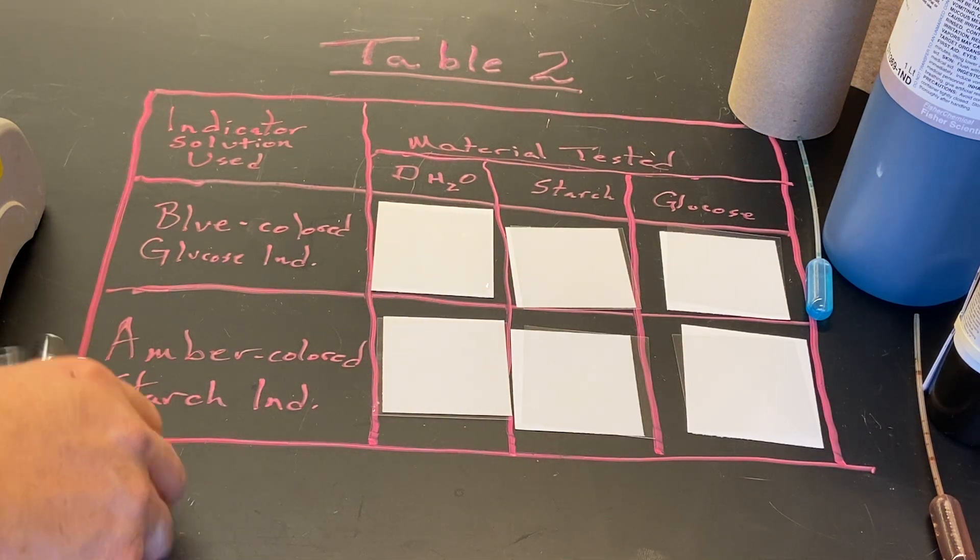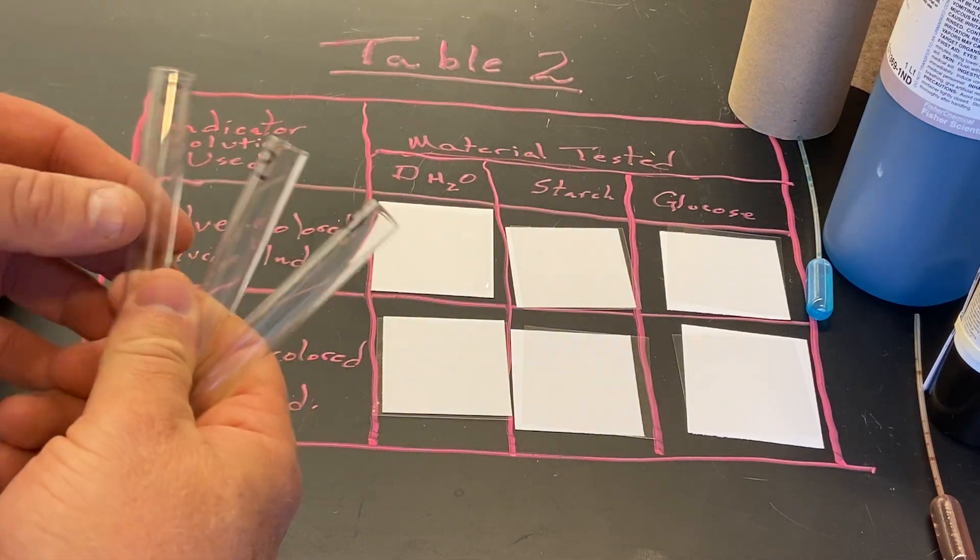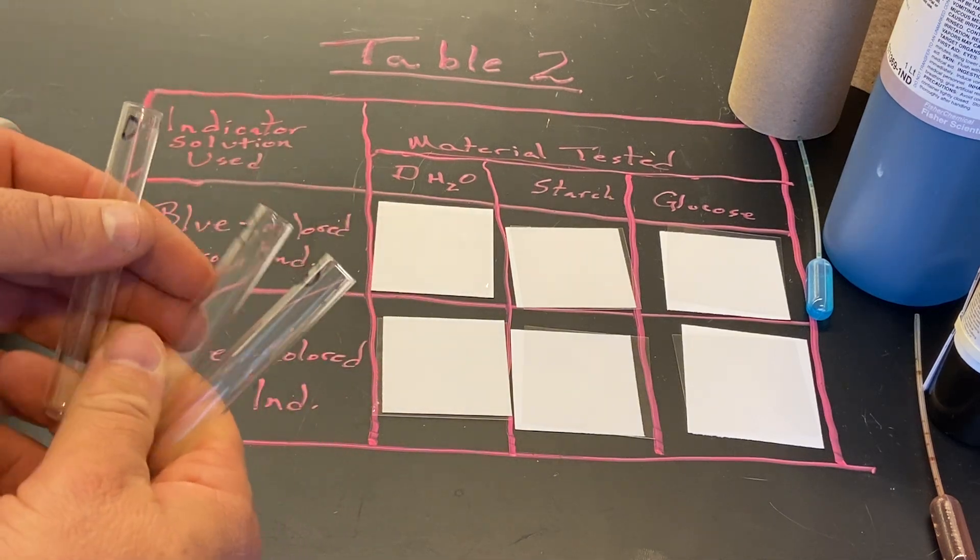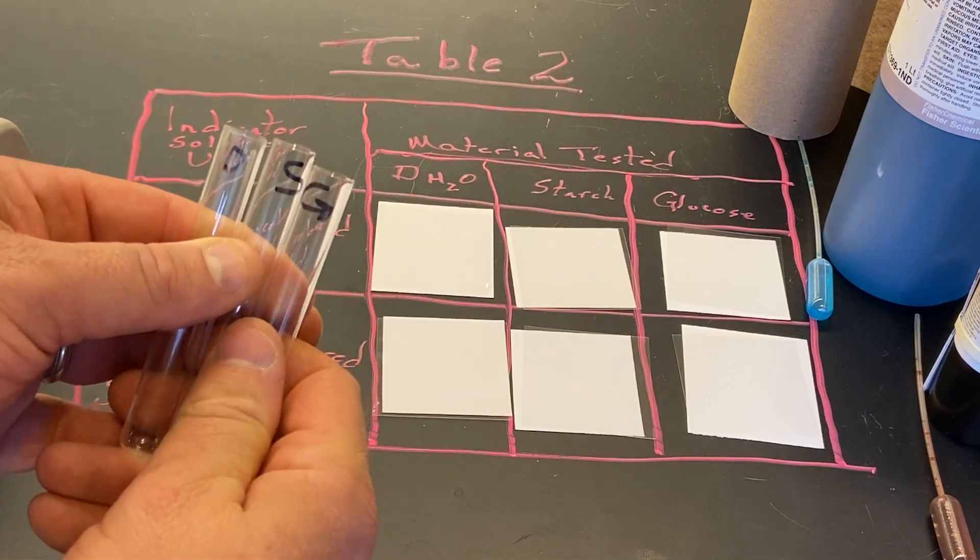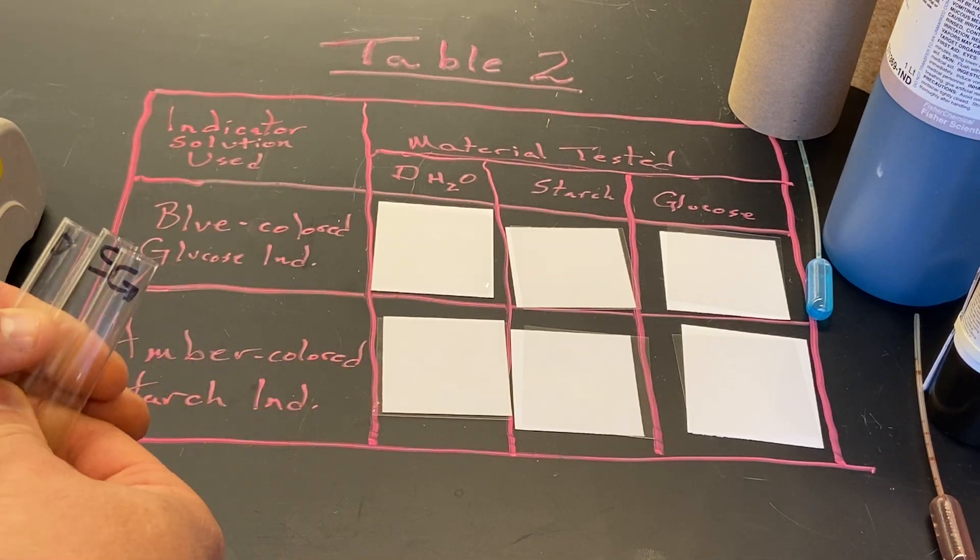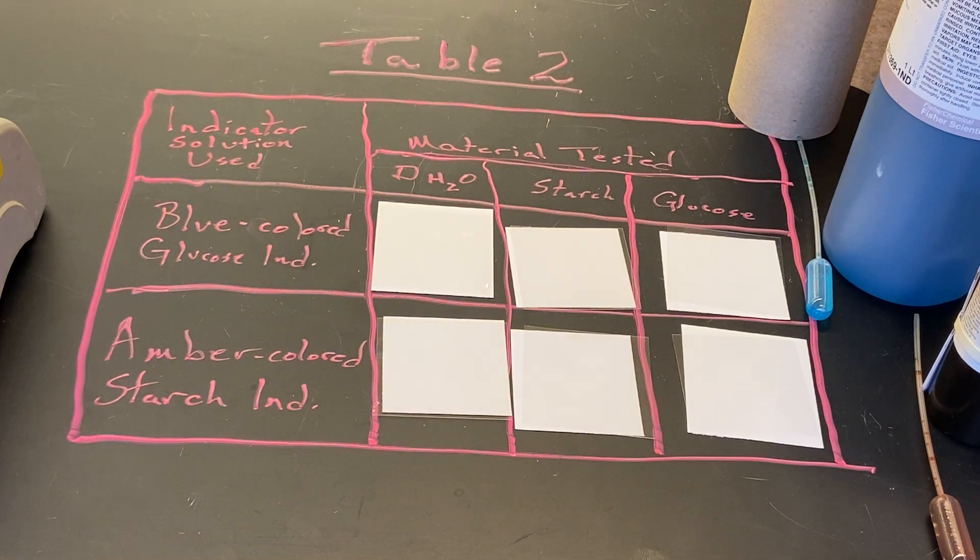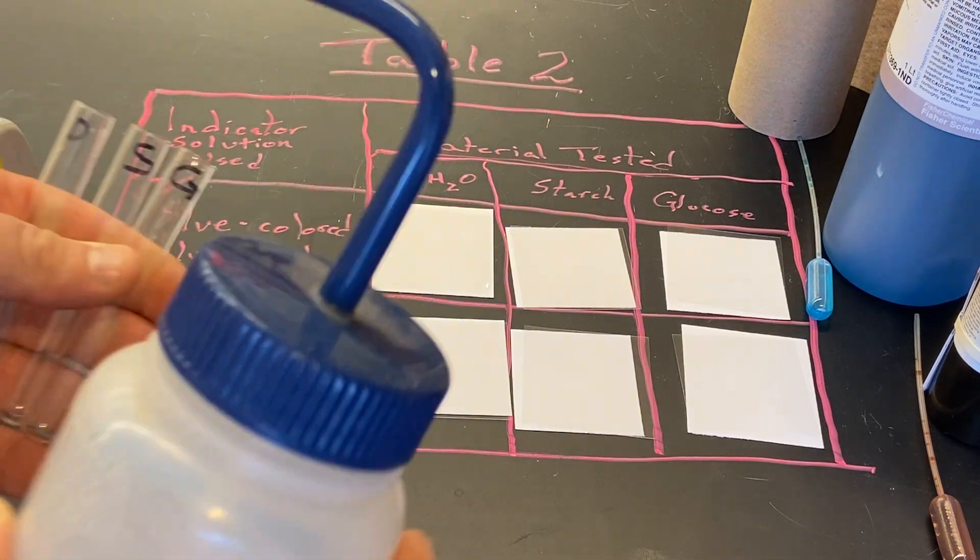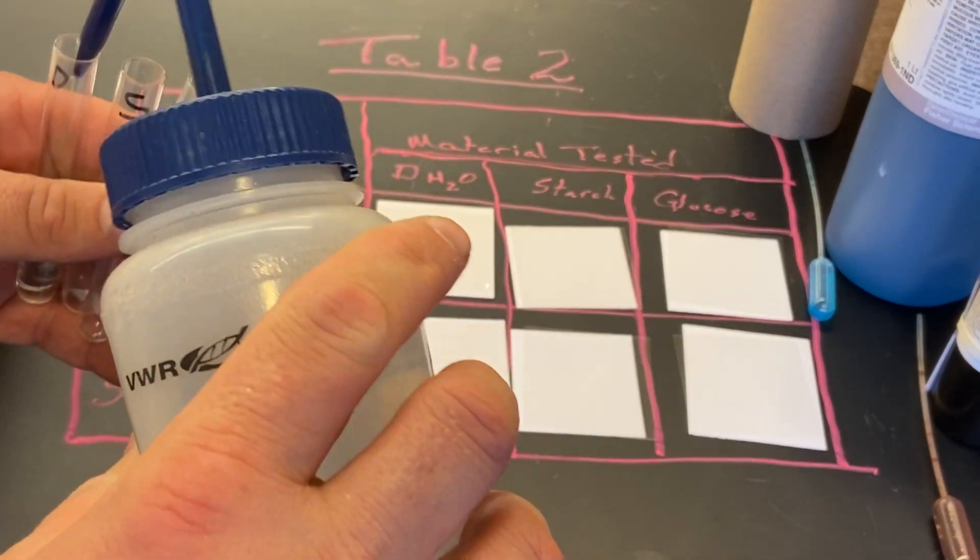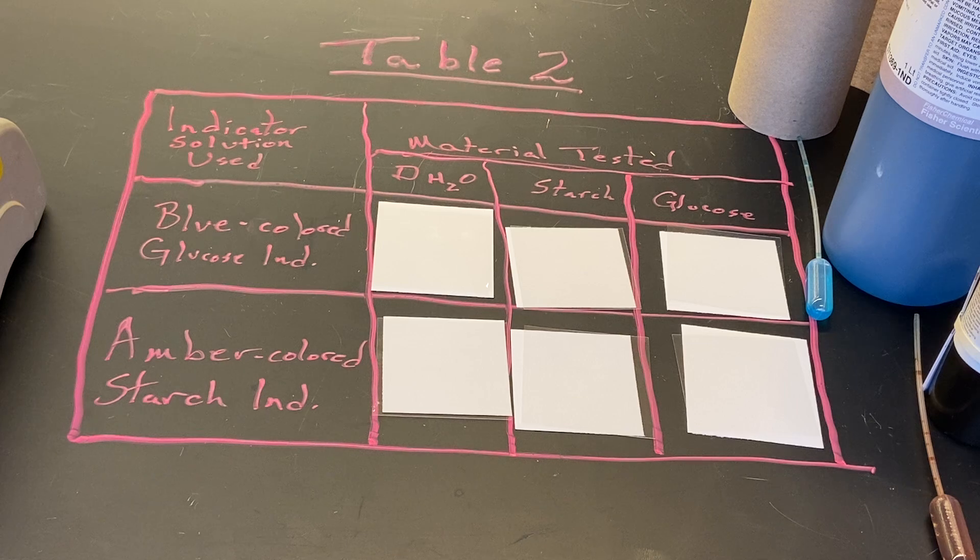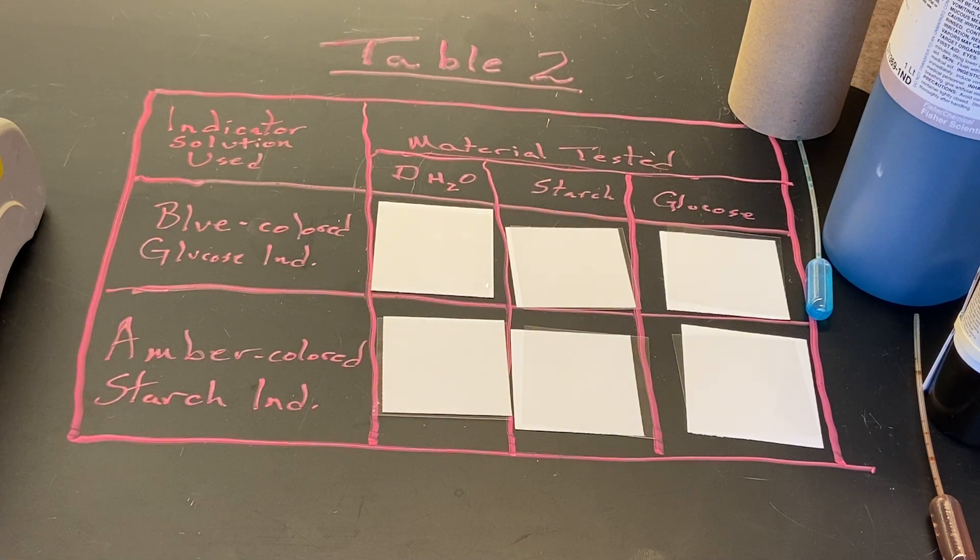I have three test tubes: one marked D for distilled water, one marked S for starch, and one marked G for glucose. We'll add distilled water first, just a little bit in there. Then we'll get the starch from the beaker over here and put it into the other tube.